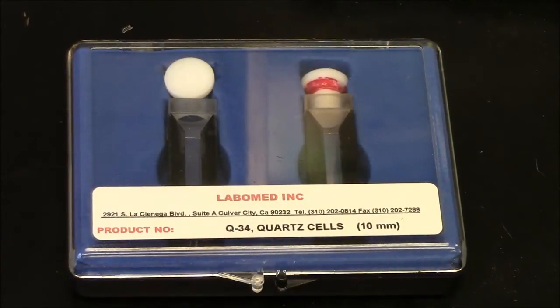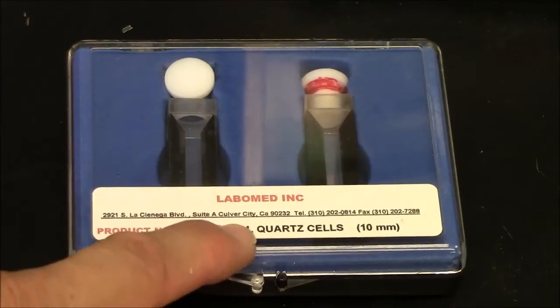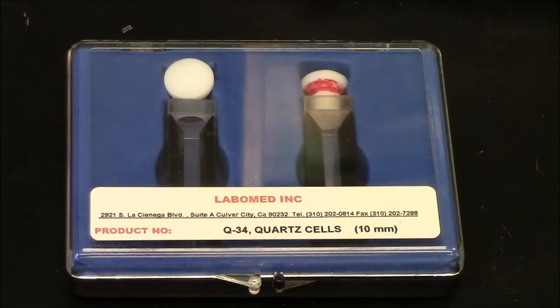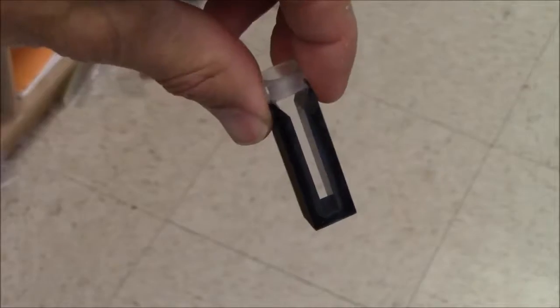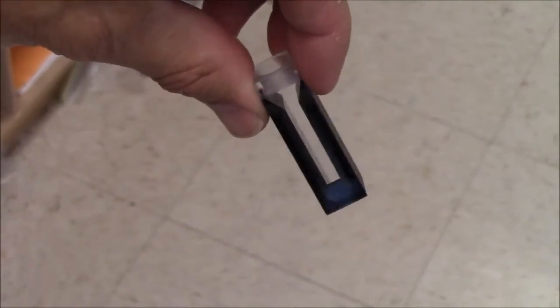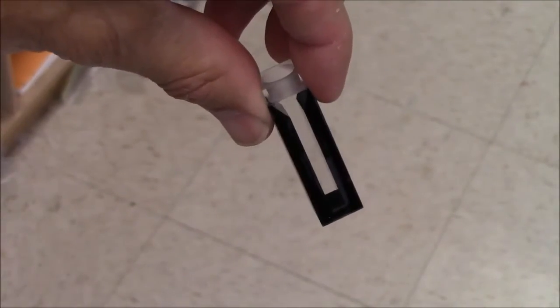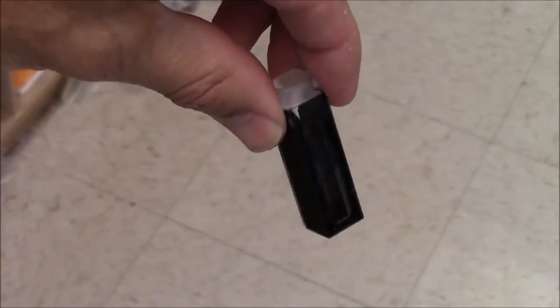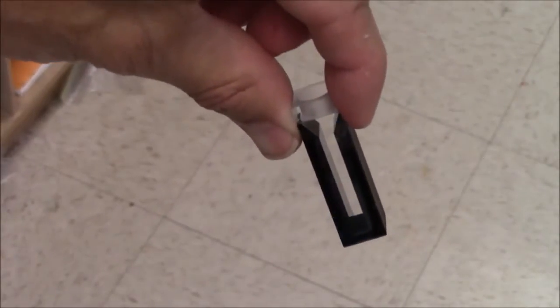The best cuvettes are quartz, and these are transparent into the UV down to about 190 or 200 nanometers. The most common cuvette you'll use in ACR is this size. It is called a semi-micro cuvette. It has a volume inside of about a milliliter.